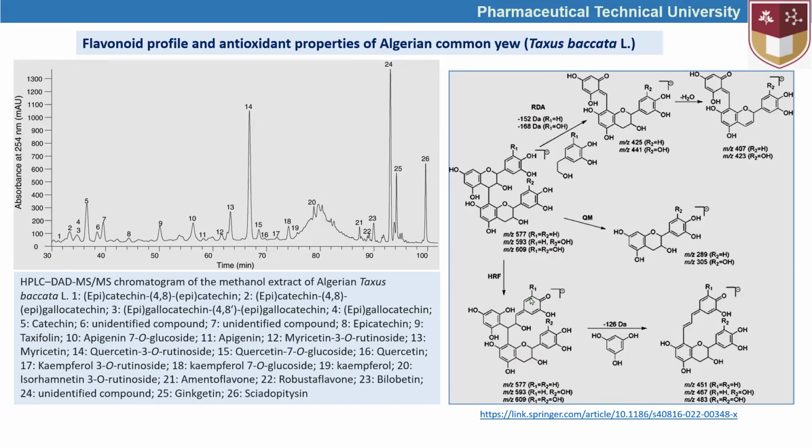And up to my understanding, here the authors used LC-MS results. So the mass spectral data obtained from this were also subjected to MS analysis. And here we can see the MS data resulting from this molecular ion by subtracting this trihydroxy derivative of benzene. So these mechanisms explain the formation of the ions of small molecular compounds, I mean lower molecular compounds. In high molecular compounds, different approaches are used.